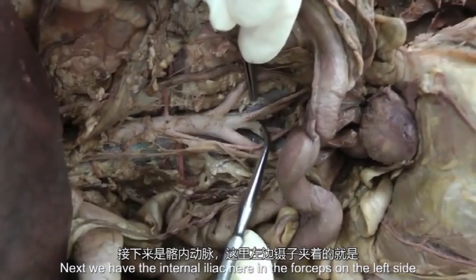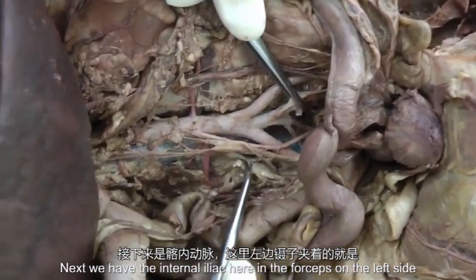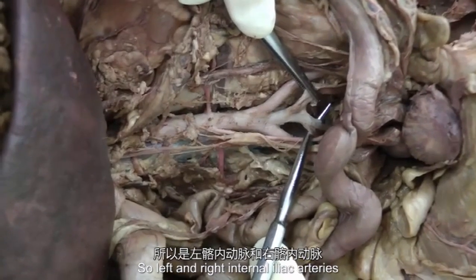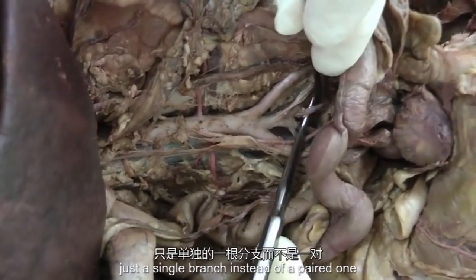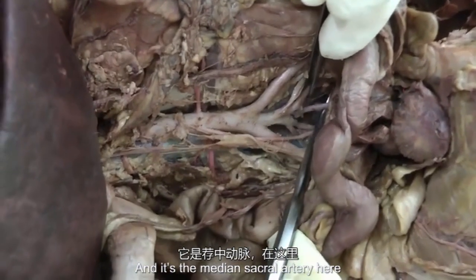They'll pass through the vascular lacuna and become the femoral arteries. Next we have the internal iliac here in the forceps on the left side, and here, elevated by the probe, on the right side. So, left and right internal iliac arteries. And then the final terminal branch is just a single branch instead of a paired one, and it's the median sacral artery here.